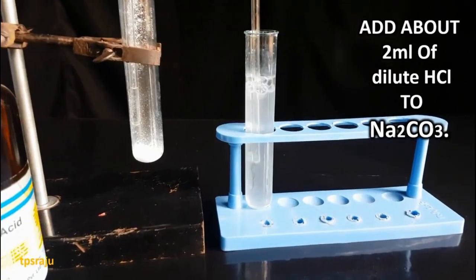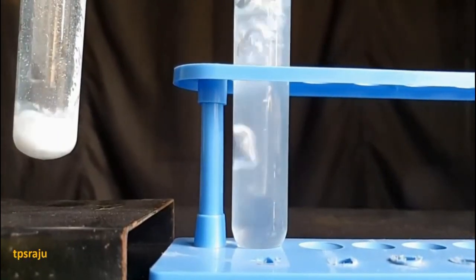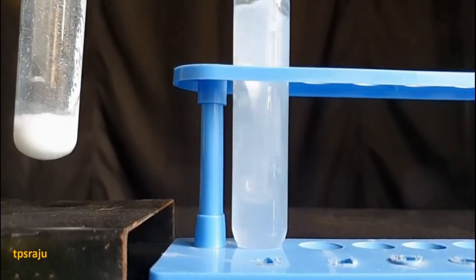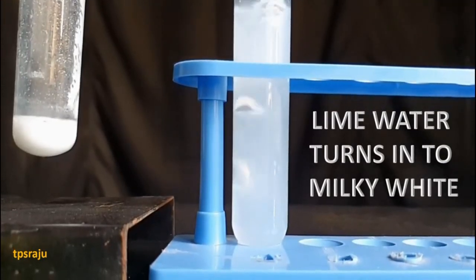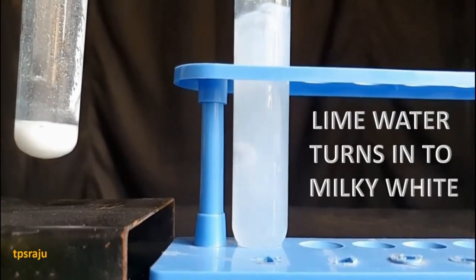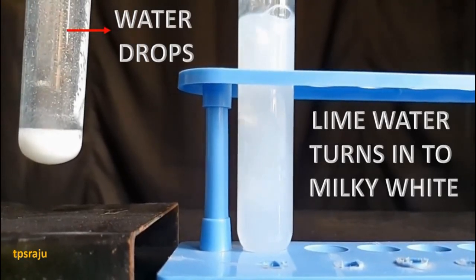When hydrochloric acid is added to the sodium carbonate, gas is released and this gas is sent to the other test tube through a delivery tube. Here, when we see the second test tube, the lime water turns milky white. Only carbon dioxide turns lime water milky white, when sodium carbonate reacts with hydrochloric acid.